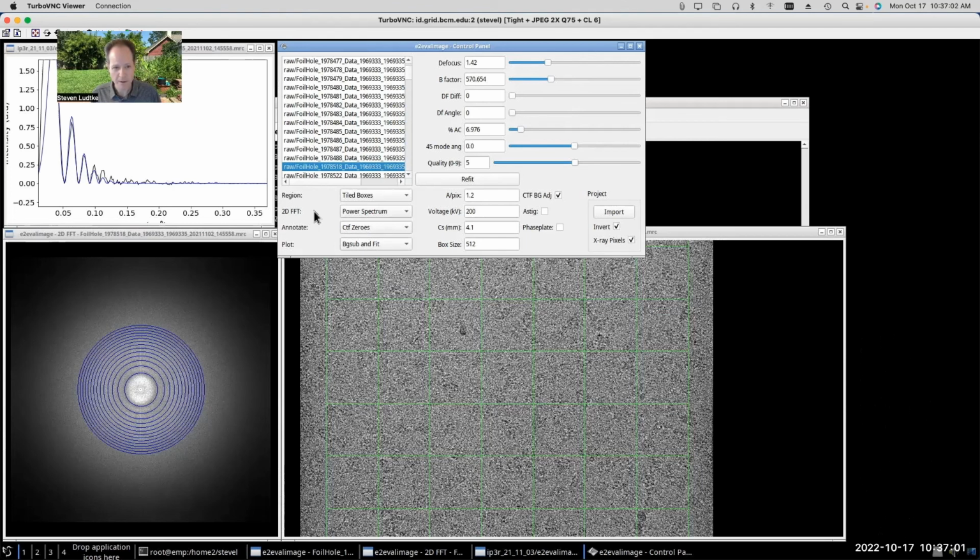When you image with a lens, the higher the resolution you get to, the finer the details you look at, the less signal you get out of the lens. There are several factors that go into that in an electron microscope. That's what those MTF terms we were talking about are.